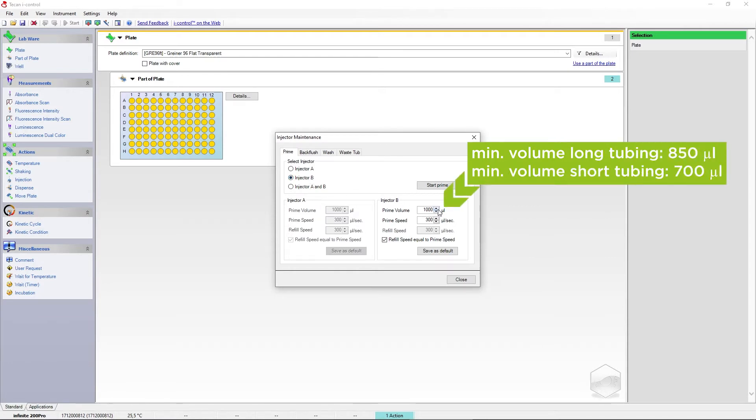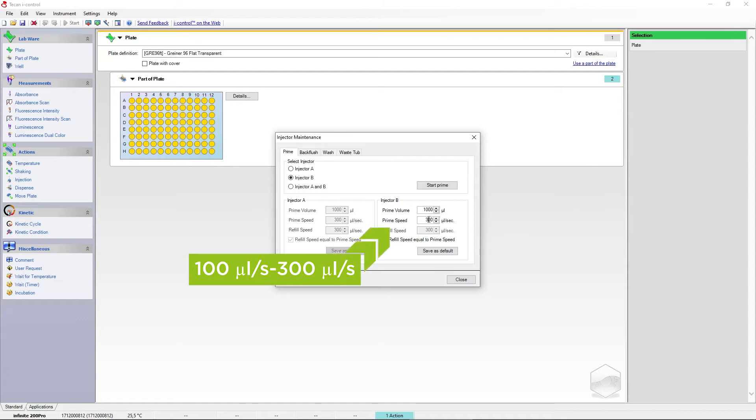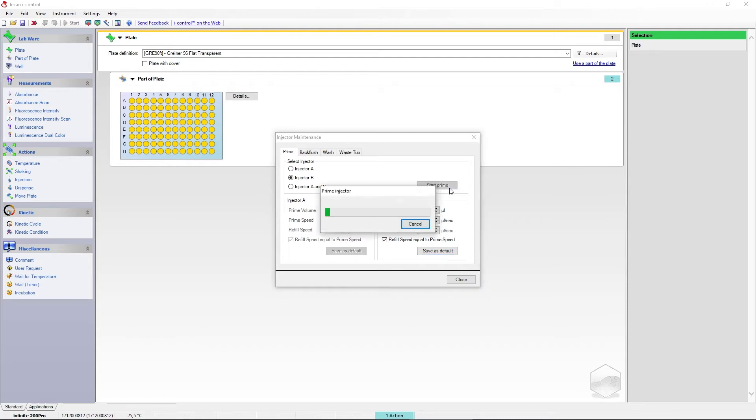Adjust the priming volume depending on your tube length. The speed and refill speed are dependent on the individual liquid viscosity — the higher the viscosity, the lower the speed should be. You can save your settings for future use. Click Start Prime.